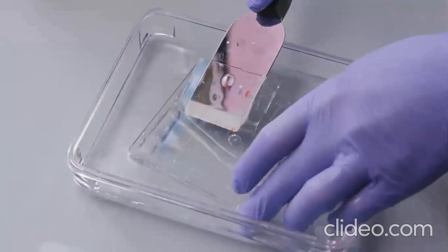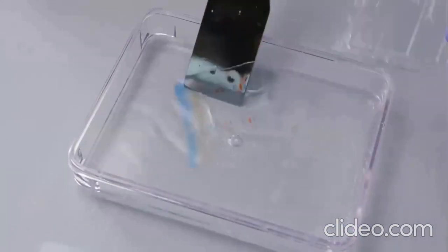The gel is now ready for Western blot transfer, Coomassie stain, or another protein analysis method.